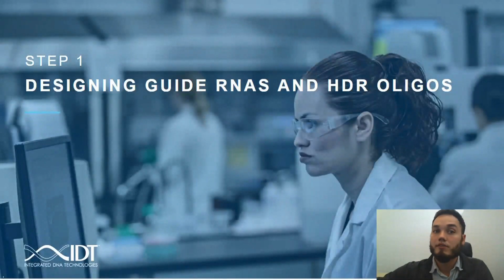So first, we'll cover considerations in design of both guides and donor oligos for HDR and the IDT tools that exist to help perform these tasks.